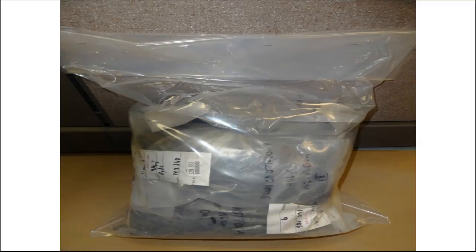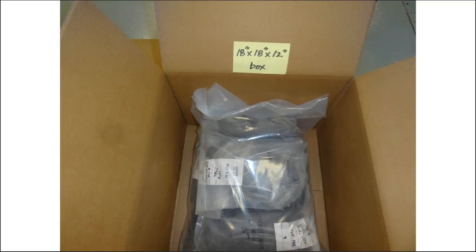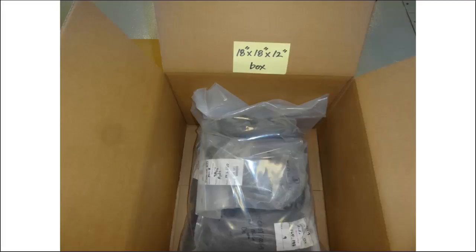I would recommend about 50 pounds worth of samples. Make sure you have complete pedons in the bag so we don't mix up pedons in bags and boxes. Here's the box that we will provide to you. It's an 18 by 18 by 12 box. It's heavy-duty, triple line, designed for heavy-duty use. And so you'll put that secondary bag, with the primary bags inside it, into that box, and that secondary liner is also 8 mil.